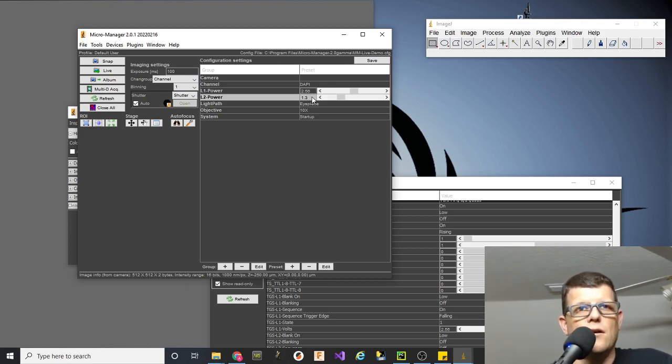That's fine. You can open up the power control, configure it as needed outside of MicroManager, and then just run the TTL control from inside MicroManager using the Triggerscope. In addition, many LEDs and other power sources, even older power sources, can use voltage and analog input for control. So sometimes you only have voltage. There's actually a digital to analog shutter device built into MicroManager. So let's say all I have is analog voltage. Well, when I turn the shutter on, it sets it to whatever the voltage is that I want, and when it's off, it sets it to 0.